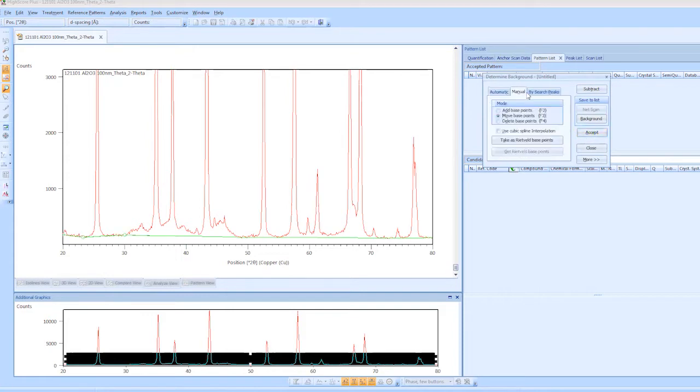Another way to do this is manually. So you can see that this point here is a little bit elevated. I'll actually come in here and drag this down a little bit. I know that it's supposed to be fairly flat. It should be high at the bottom here and then it'll flatten out. See how this point here is way above these peaks here? You want to bring that down. You want to make this as level as possible, just a gradual curve.